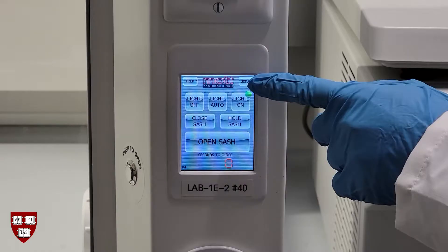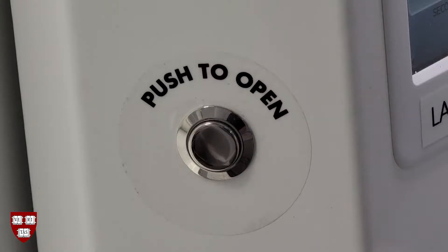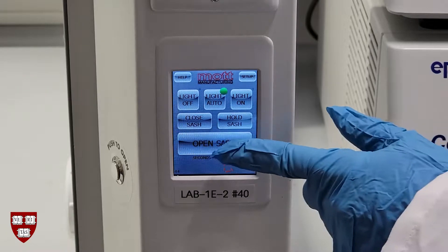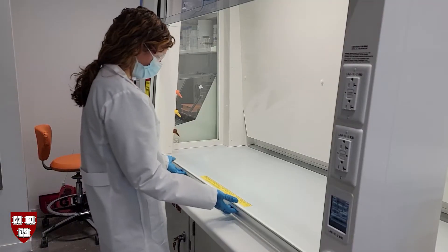They are equipped with a digital control panel, a motion sensor, and an analog sash opening button. The sash can be opened in a few different ways. You can press the analog sash open button to open the sash, or you can press the open sash button on the digital control panel to open the sash.